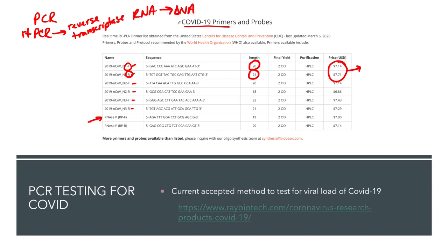And this is done with COVID because the COVID-19 coronavirus, this particular virus, is an RNA virus. The virus carries RNA, not DNA. So we have to reverse transcribe that RNA first into DNA so we can then use the PCR testing to look for the DNA sequences.